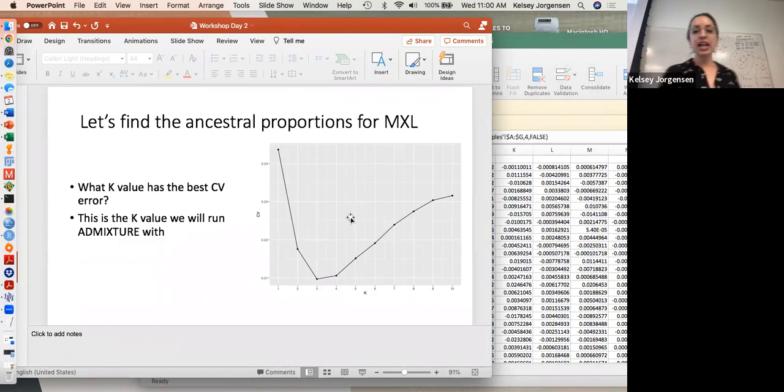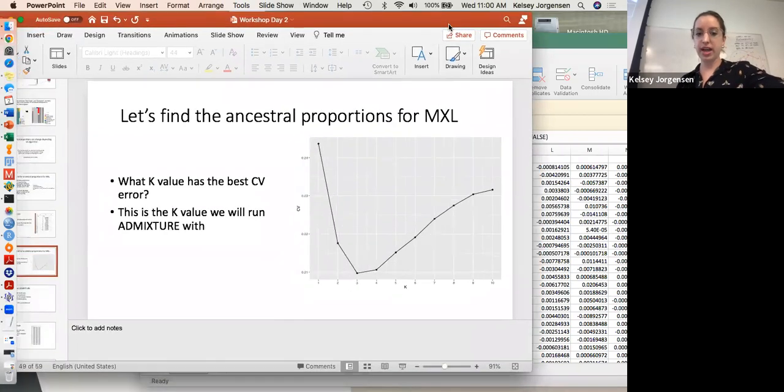So, what you're really looking for if you do use admixture and you do want to plot this ahead of time, which I recommend, is you want to put enough K values in the algorithm that you see it go back up, right? And that way you know for sure you've reached the lowest error possible. Because if you're getting lower and it just keeps going, you don't know that you've reached it. So I usually start with 1 through 10, and that's usually sufficient.